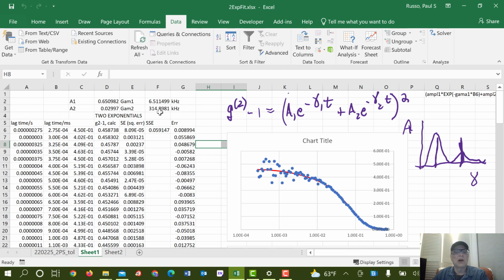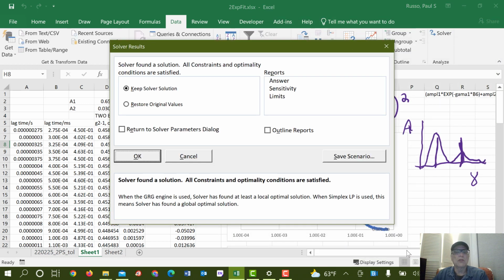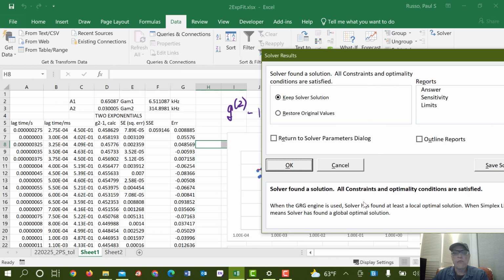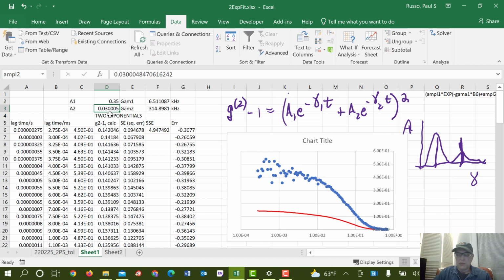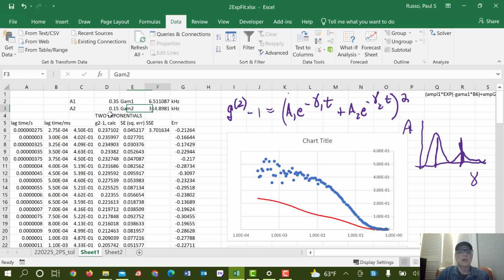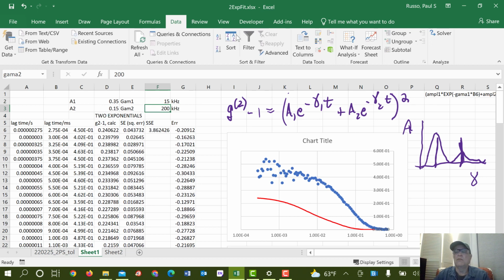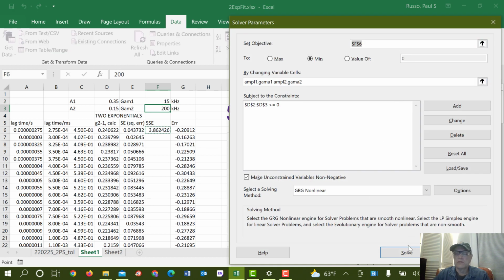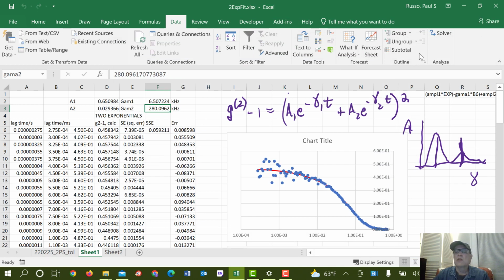To be on the safe side, we might want to run that again. Looking for changes. If there were changes, they were minor. We would want to do the same things here that we did before. Just randomly pick numbers and see if it finds it. More or less.